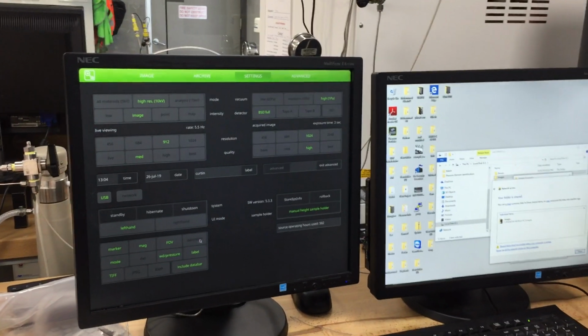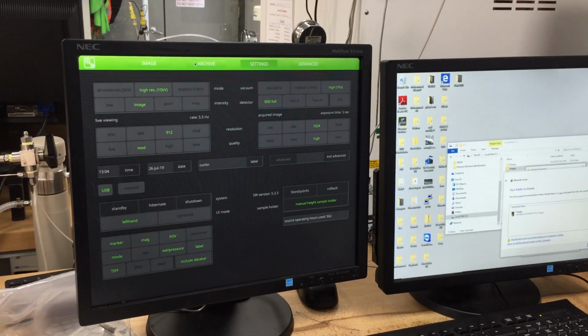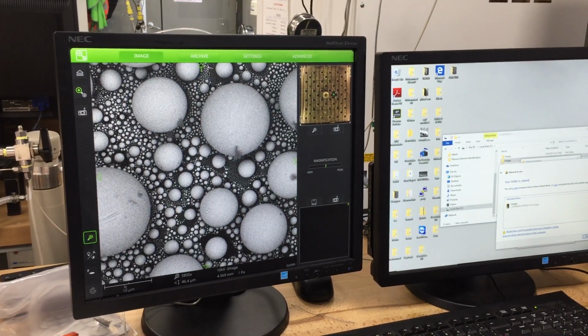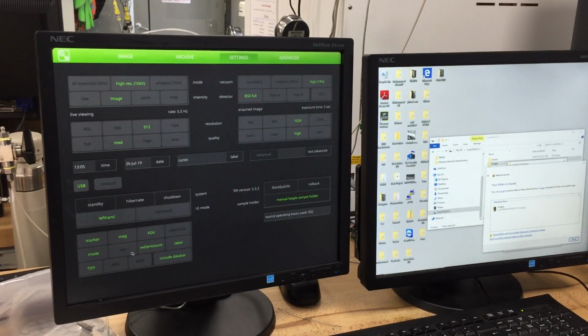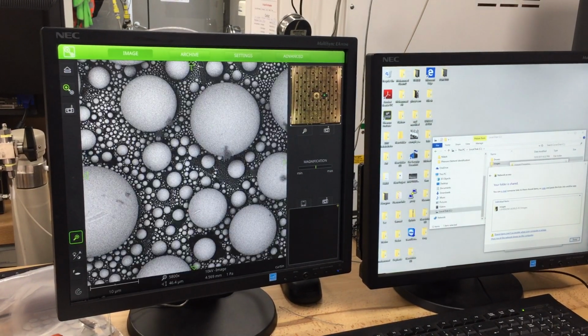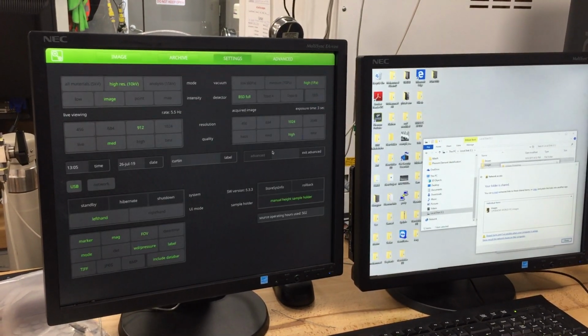And these ones are information that appears on the actual image here. You can see this is called magnification, and in the settings page, there's magnification here. So you can select what you want to show. So this is the pressure. If you want to know what pressure you used during the recording, it tells you here, 1 Pascal, because you chose 1 Pascal here.